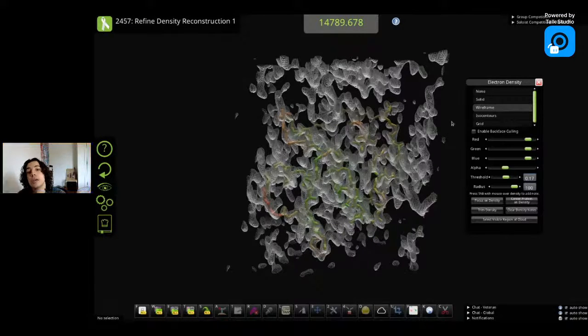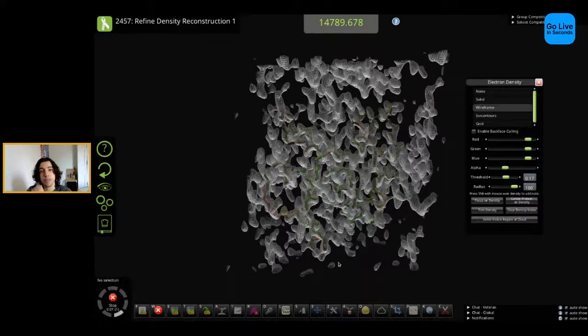So even though it can improve the Foldit or Rosetta score of the geometry, it might conflict with the crystallography data and cause a score drop. We could also try to match this density better and continue increasing the score. But if you play with this tool, you create a model that you think looks good, and the Refine Density tool tells you otherwise, it might be a sign that you took a step in the wrong direction, or it could also just potentially be a sign that you need to improve the backbone further to match that new density.